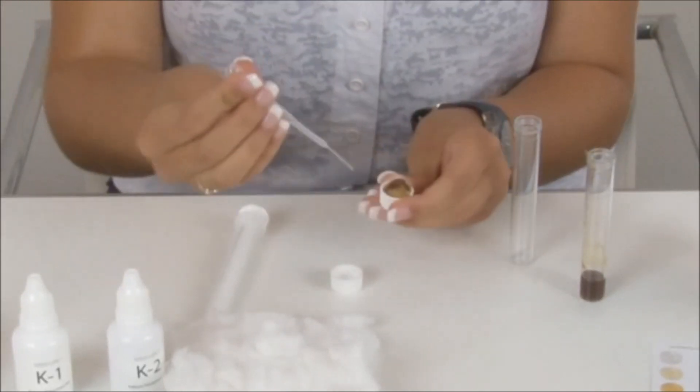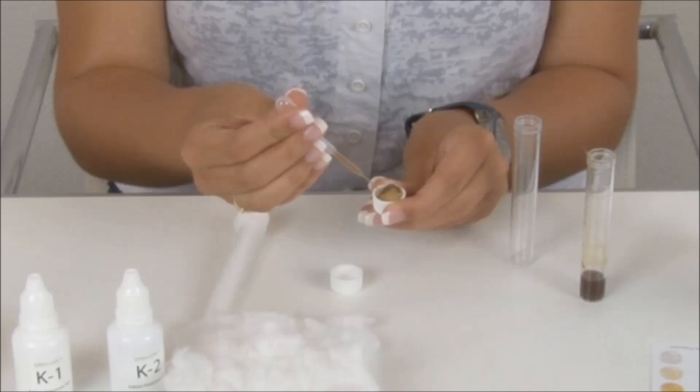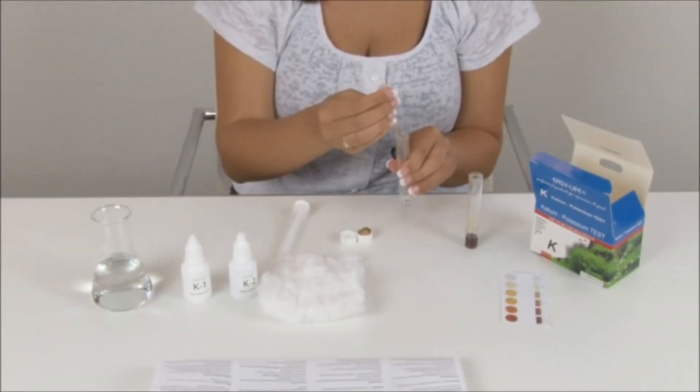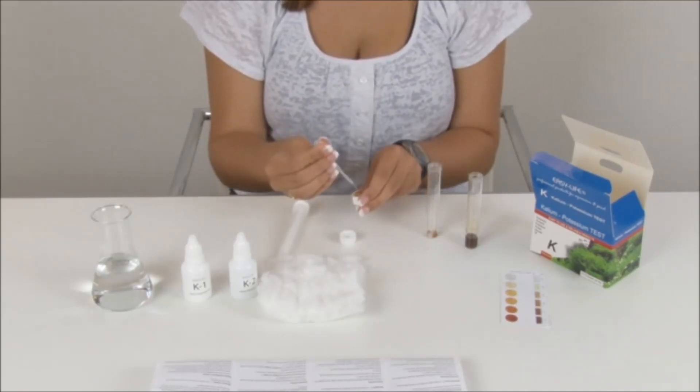Squeeze the pipette and stick it gently into the cotton, then fill it slowly with clear liquid up to the mark if possible. Grab the second clean test tube and fill it with clear test liquid to the height indicated on the color chart.